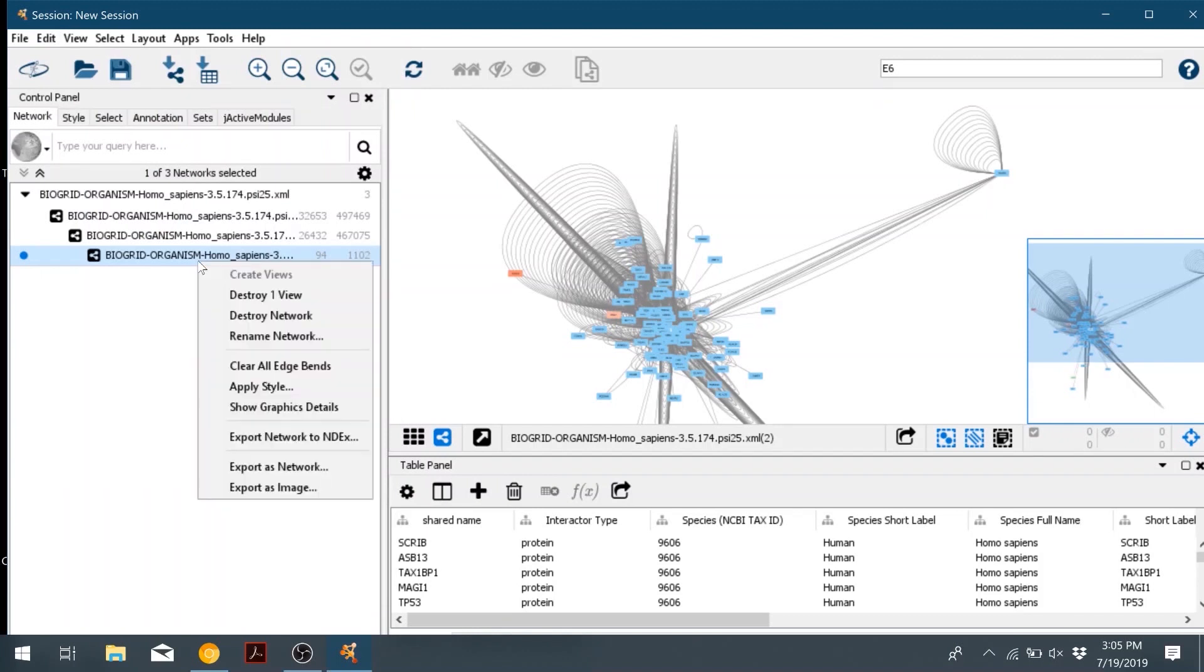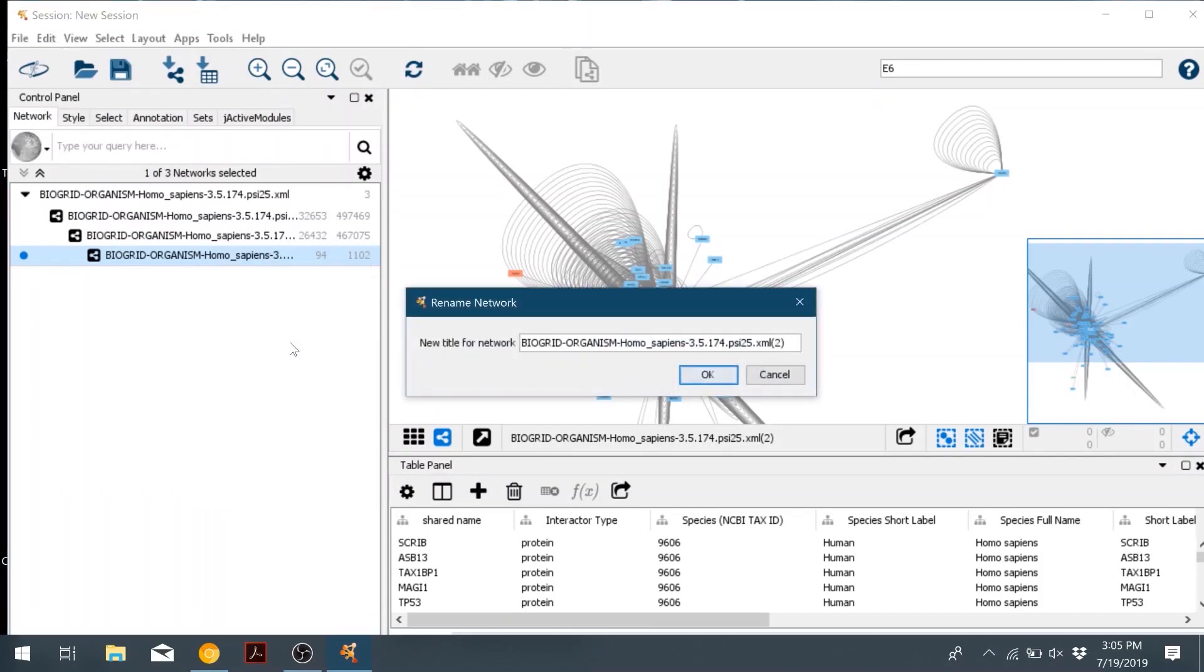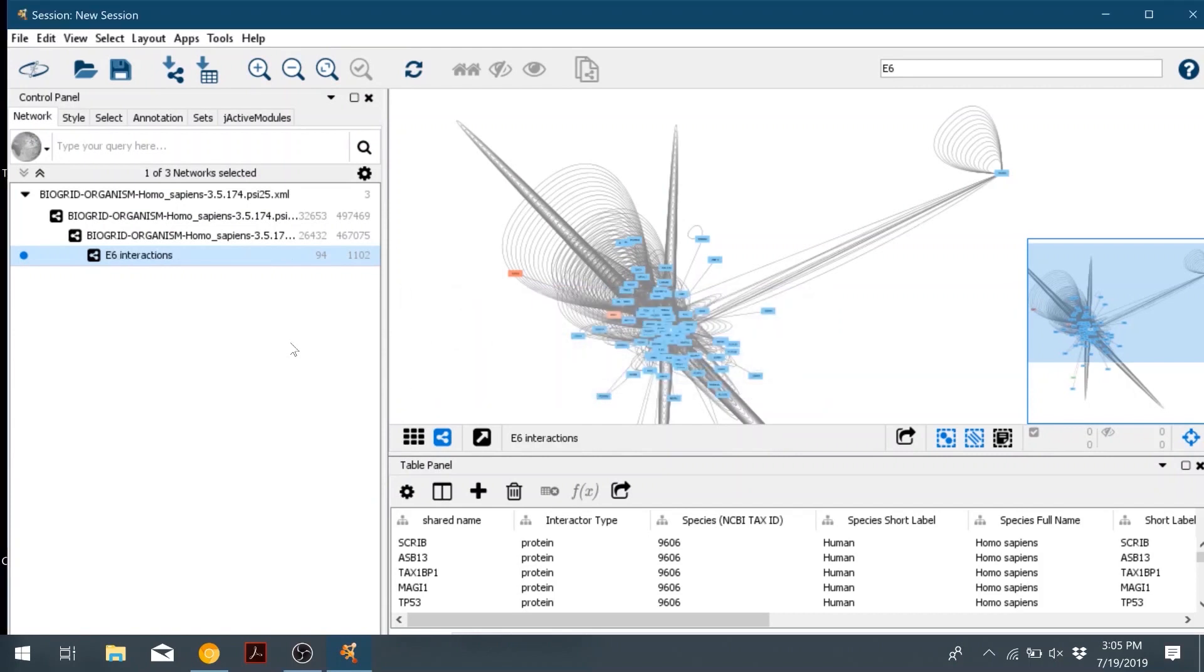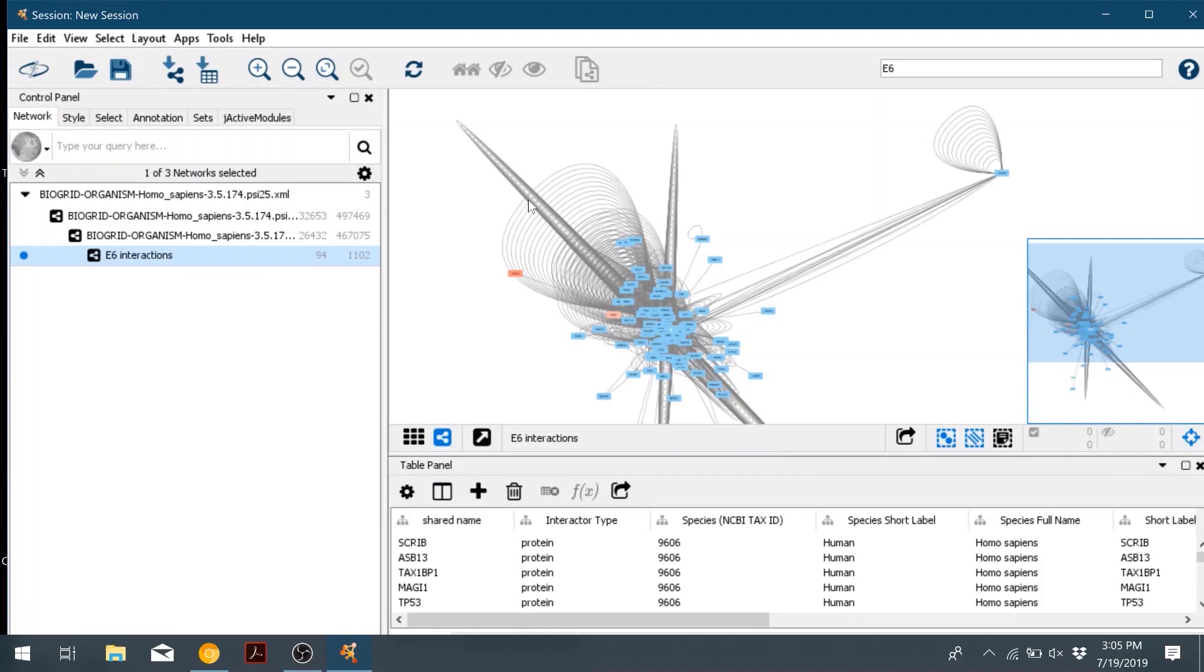So then we can rename the new sub-network we made by right-clicking and rename it. We'll call it E6 interactions. And then also if we notice on the actual network, we have a lot of duplicate edges or lines between nodes, and also a lot of these curved ones that are like self loops saying that the protein interacts with itself. They're kind of redundant.